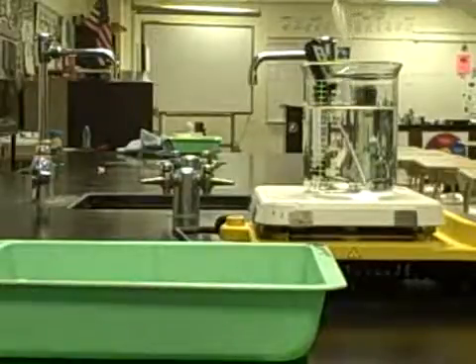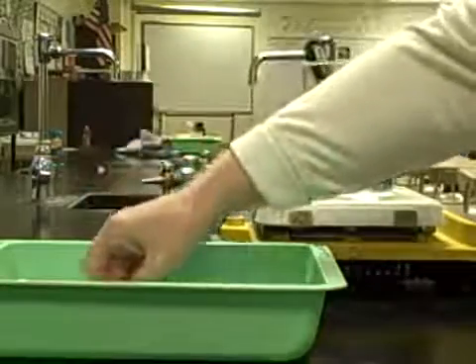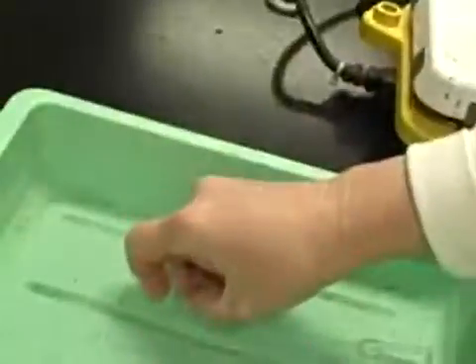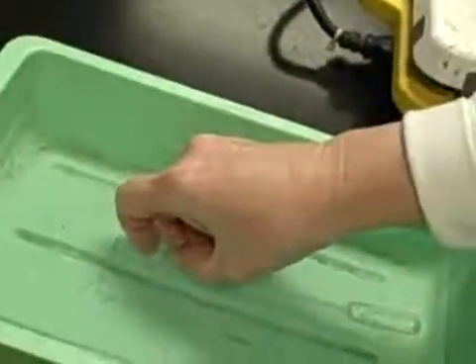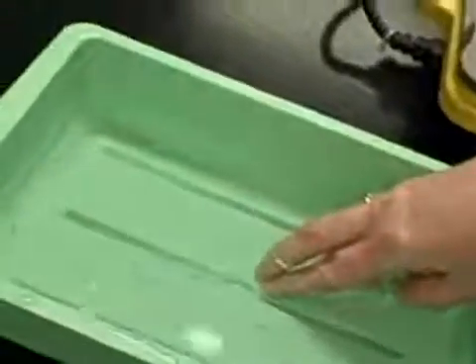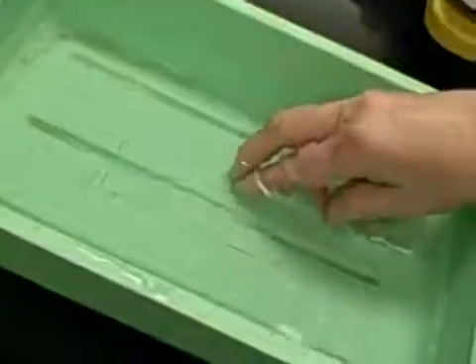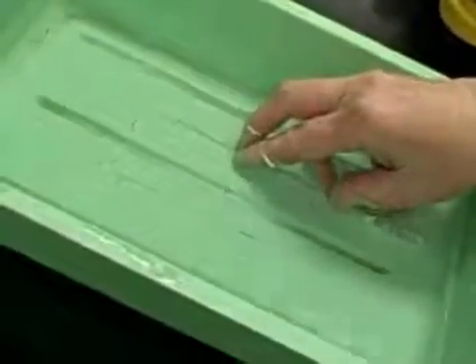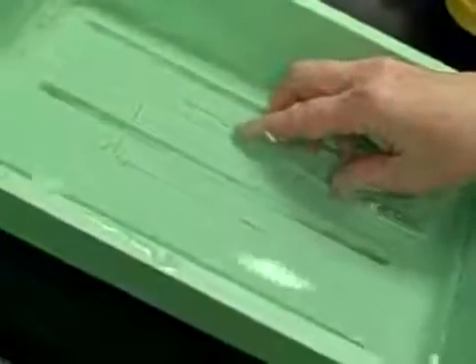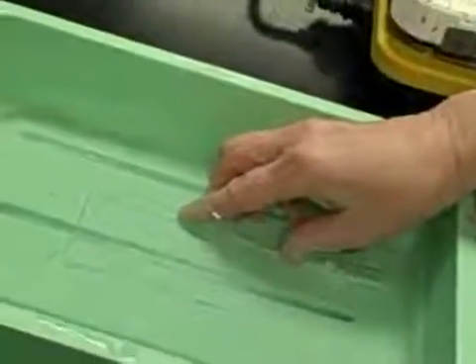And then it says submerge it in a basket of cool water. So I'm going to go ahead and submerge it in here. And by submerge it, I mean get the whole thing underneath, and you might need 2 hands to do this. And once it's underneath, remove your finger from the end. And now I'm just going to let it cool down for a minute. And as it's cooling down, you want to hold it underwater, but you also want to be careful that you're not squeezing the bulb and affecting the volume in there in any way.